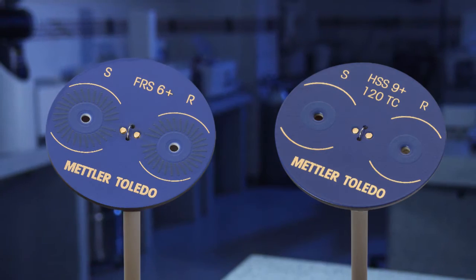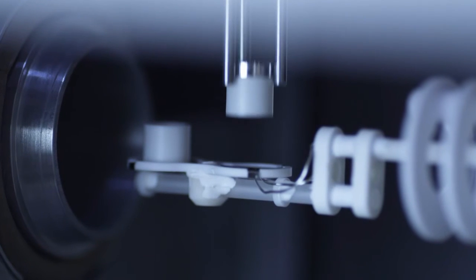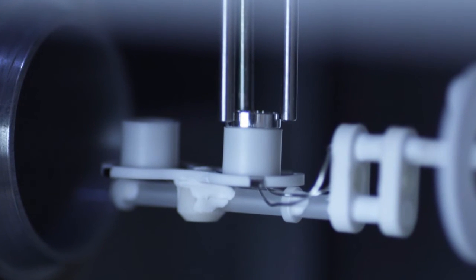Innovative technology, versatile modularity and Swiss quality. Thermal analysis excellence is the future of thermal analysis.